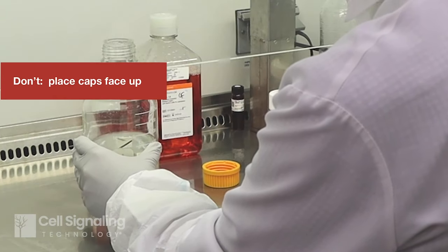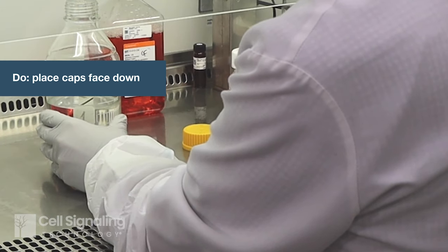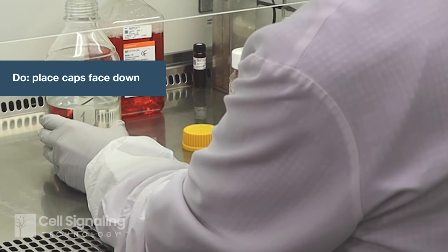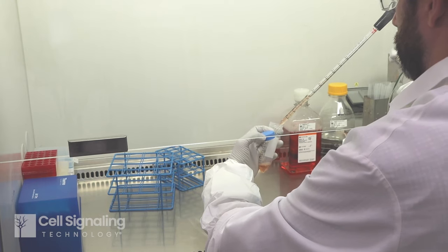When removing a bottle or tube cap, don't place it face up — place it on the surface face down. You may use your non-dominant hand to hold the cap while pipetting, but this takes practice and dexterity.